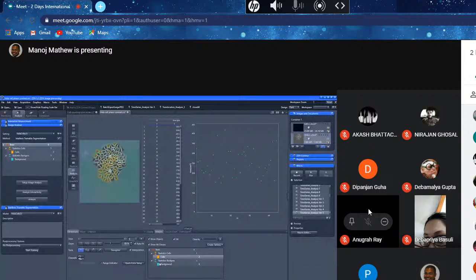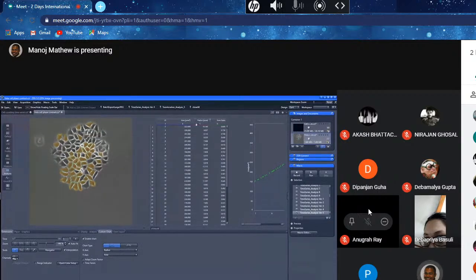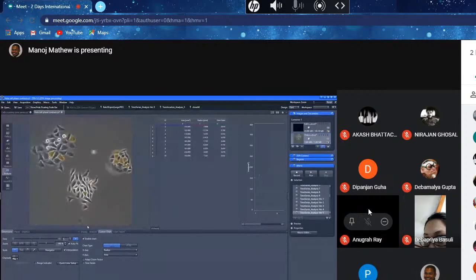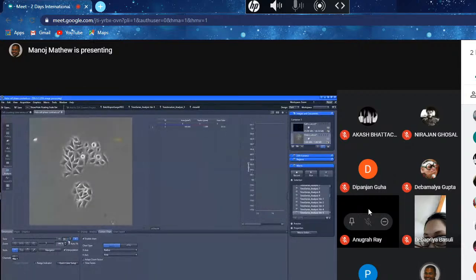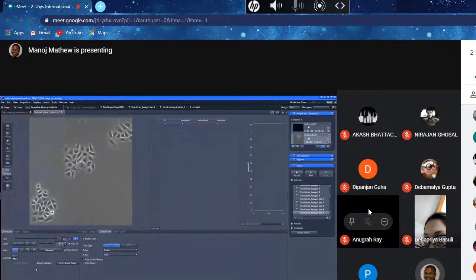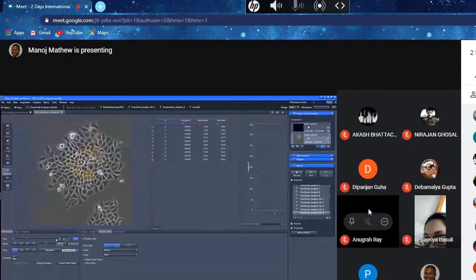All right. So I don't want to see the background. I only want to see the cells, and I want a graph to be plotted between radius and area. You can start seeing that curve. Area is pi r squared. You can see the measurements, and if I run this, you see the segmentation is done on all the images that were there. In every image where this condition is satisfied, you see the objects are detected.